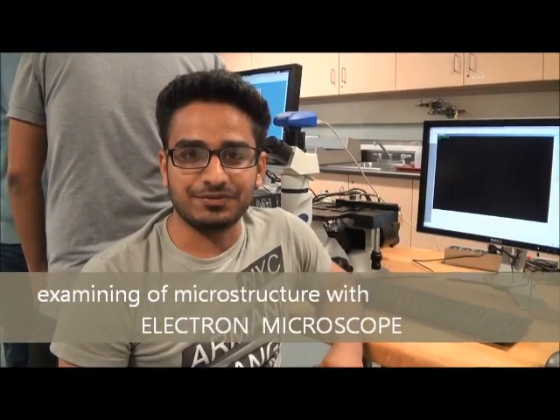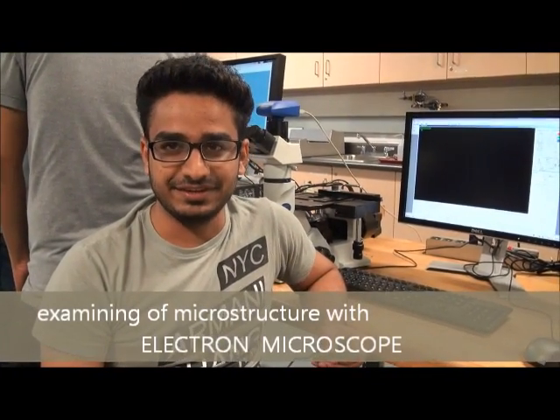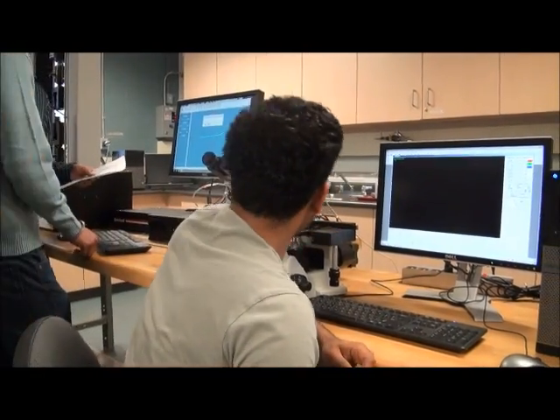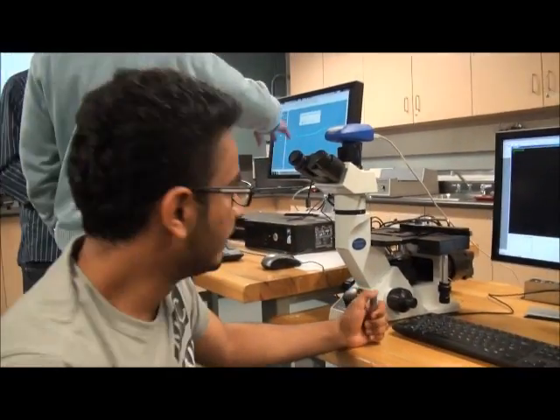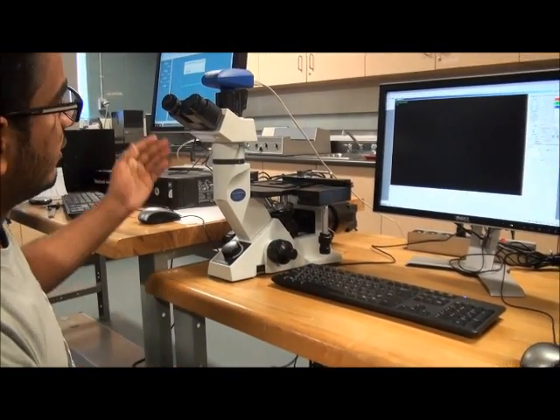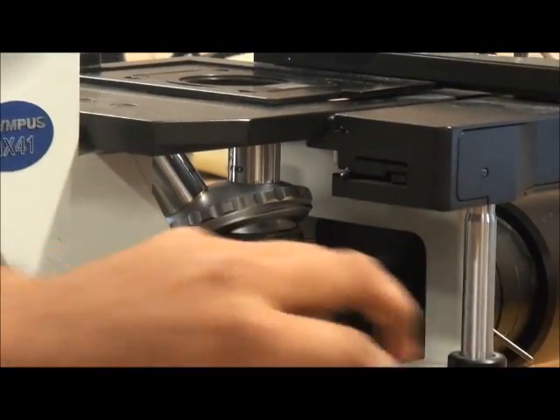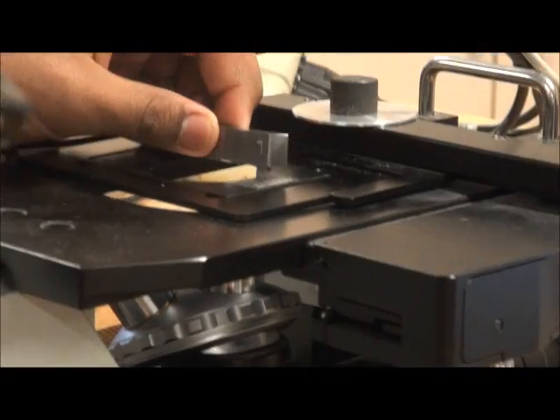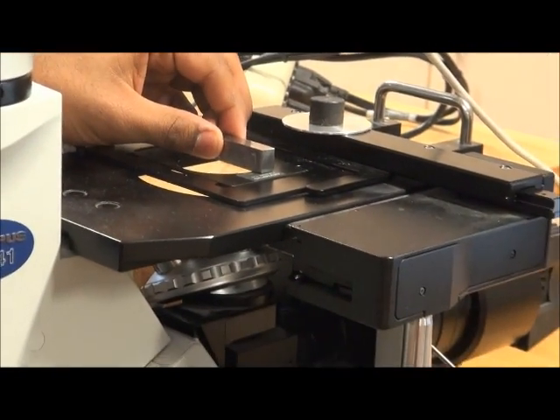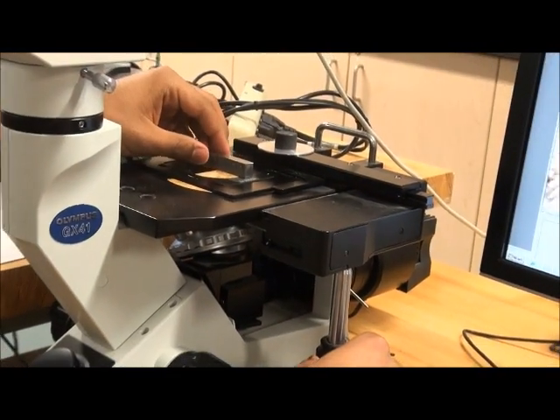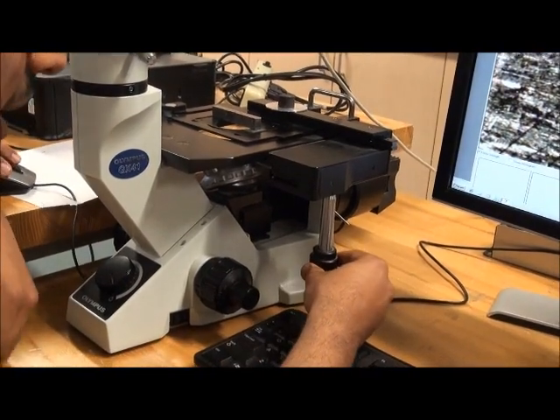Now, we are going to start with the examining of the microstructure of the steel in the different zones: first the low carbon zone, then heat affected zone, weld zone, and the heat affected zone and low carbon zone as well. This is an optical microscope attached to the computer. Here is an eyepiece, objective lens with different powers, and here is the adjustment. We can place our sample over there and we can adjust the position by moving it.